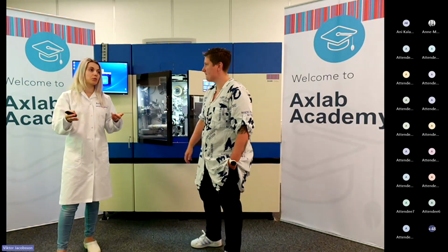So for us it's better to know we have some scheduled service done. Exactly, but of course it comes with the throughput. The more you wear, the more you tear. So that goes hand in hand. That's the reason why we did that, because we could see, okay, we are using the instrument. You're pushing it. Yeah. Pushing it to the end.